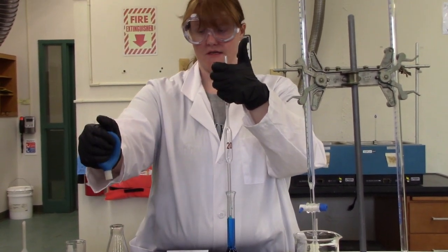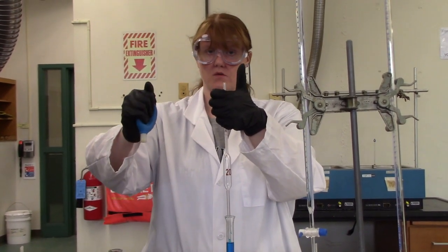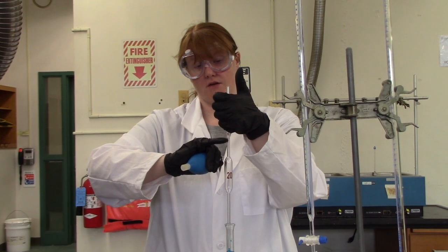So first, squeeze out the air. When you do this, if you see liquid come out, you need a different bulb. It's not going to work very well. It also means that someone sucked a bunch of liquid through, and you shouldn't let the liquid get that high. Our marking on this one is down here.